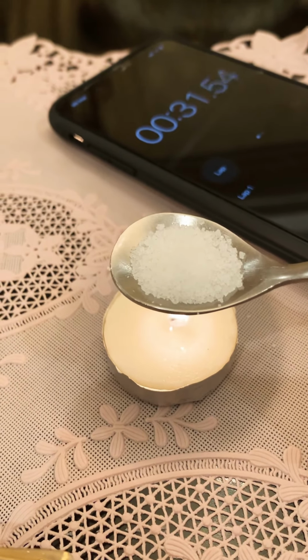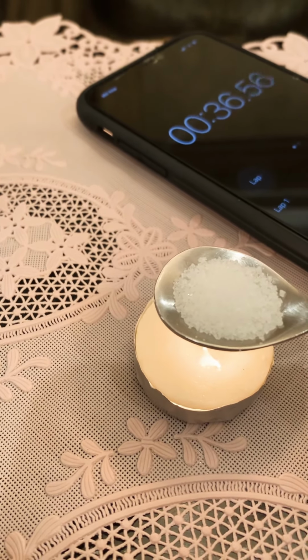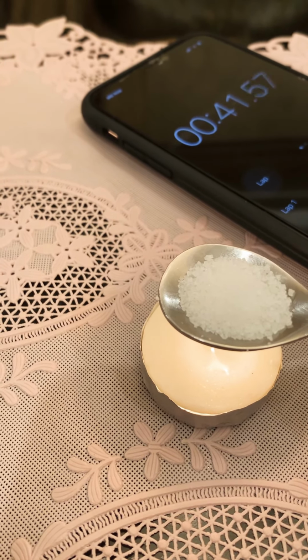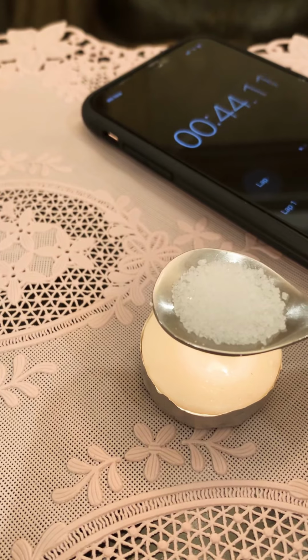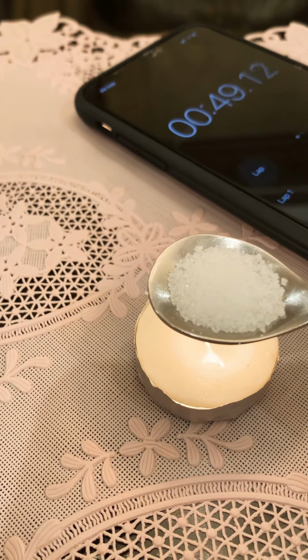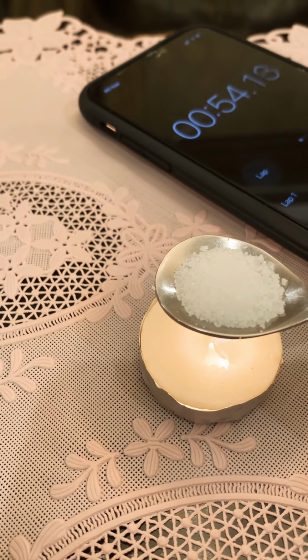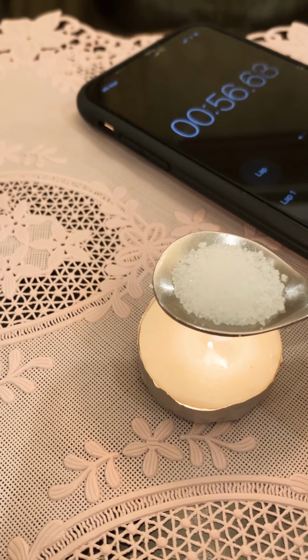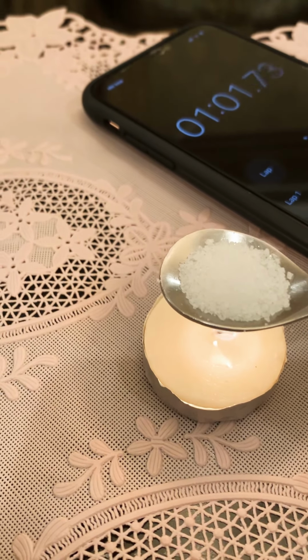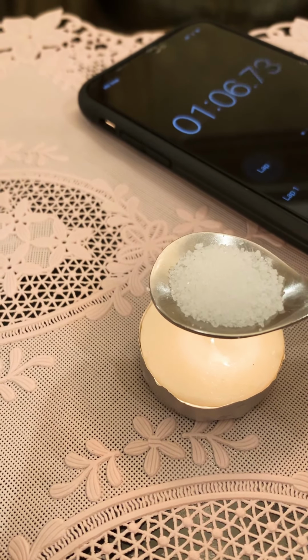We expect that the sugar is going to melt really quickly, and the candle here is not going to melt the salt, because the salt is an ionic compound, so the chemical bonds here are really strong, and it will not melt fast or easily like the sugar. However, the sugar is a molecular compound which is covalently bonded, and the bonds are really weak, which means it's going to melt very quickly.